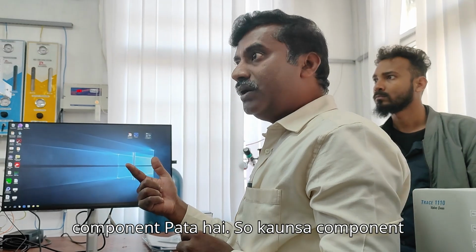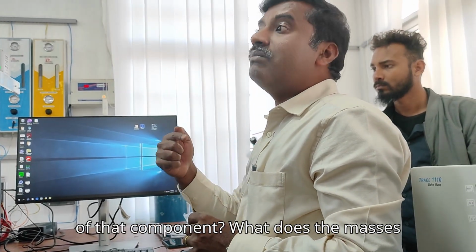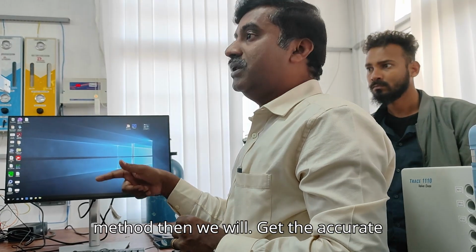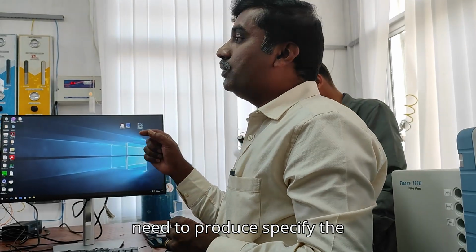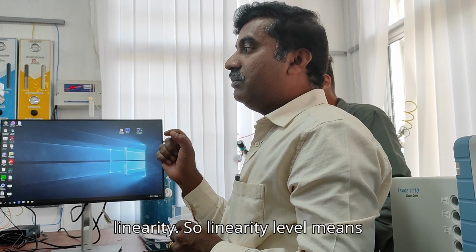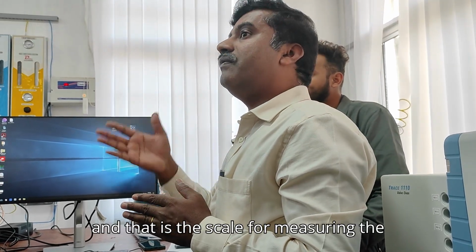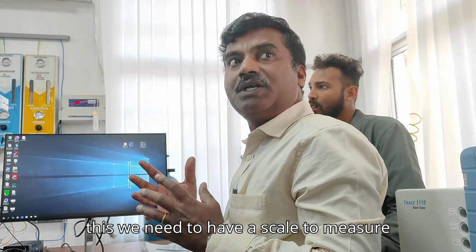So which component it is, meaning what is the retention time of that compound, what is the mass of a particular component. Everything we need to define in the processing method. Then we will get the accurate data in the processing, and then we need to specify the quantification, like a level of linearity. Linearity will be a kind of graph, and that is a scale for measuring the concentration.